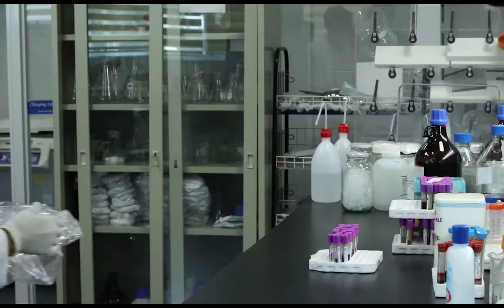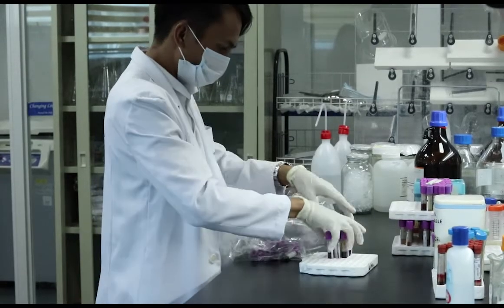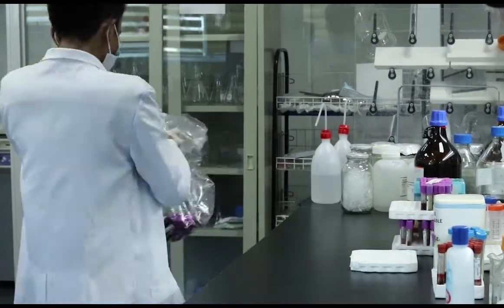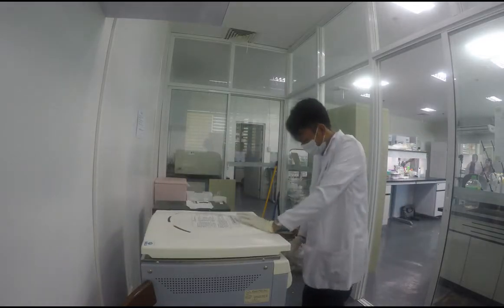Decontamination. Biohazardous waste material, such as dry solid materials, sharps, liquids, is decontaminated by placing waste bags or containers with liquids in a secondary container, load in the autoclave.